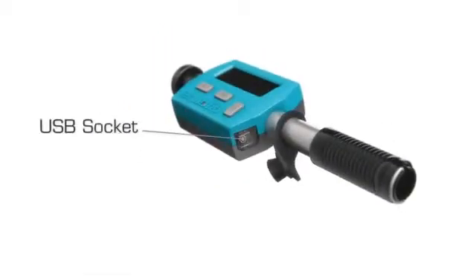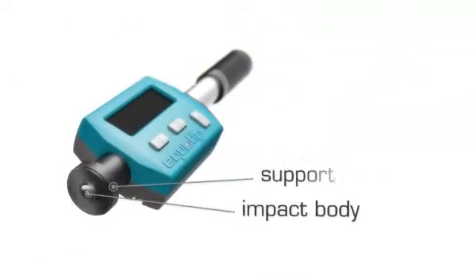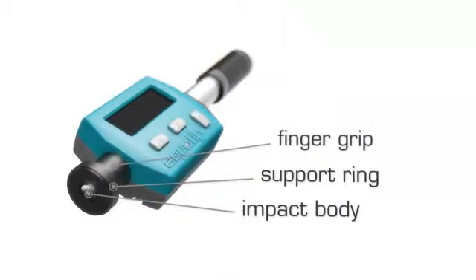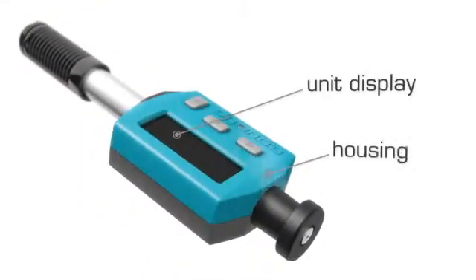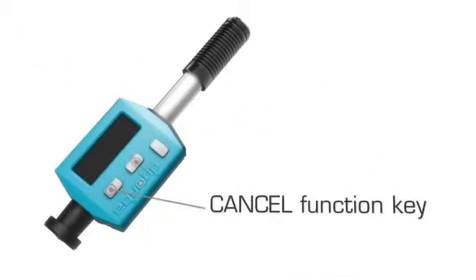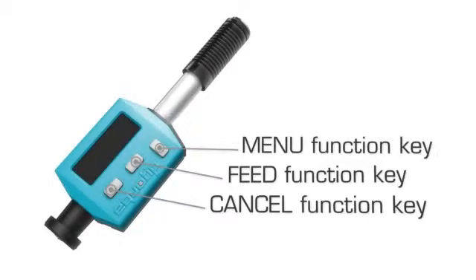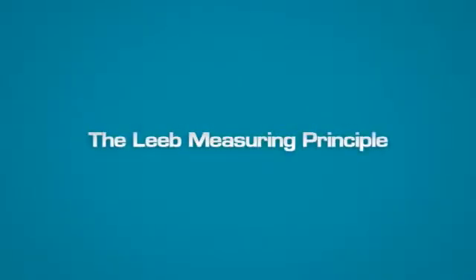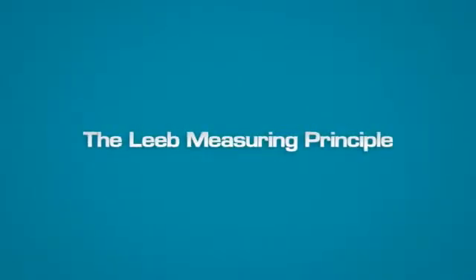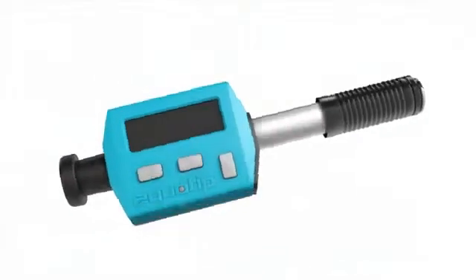The USB socket, the USB cover, the impact body, the support ring, the finger grip, the unit display, the housing, cancel function key, feed function key, menu function key, guide tube, and charging tube.